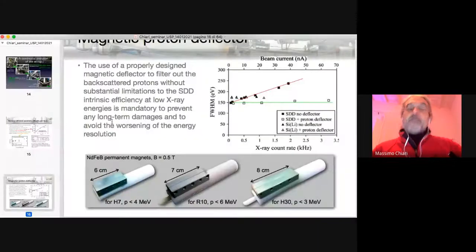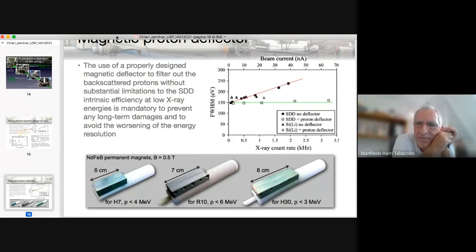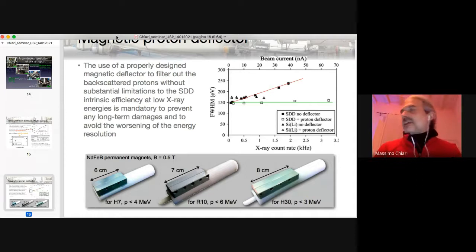Of course, in most of the cases, a strong competitor is XRF, because XRF is intrinsically simpler and thus more transportable. Exactly. Our laboratory has a fleet of transportable XRF scanners that can produce what is called macro area XRF.